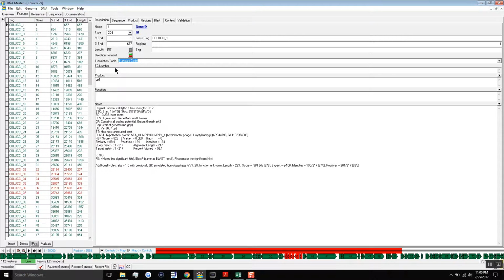the information in the database, in the protein blast NCBI database, could have changed. It could have been updated, and some more information or publications could have been added that suggest gene functions for some of the genes in your genome. So regardless of how long it took you to annotate this genome, you have to reblast all of your genes.